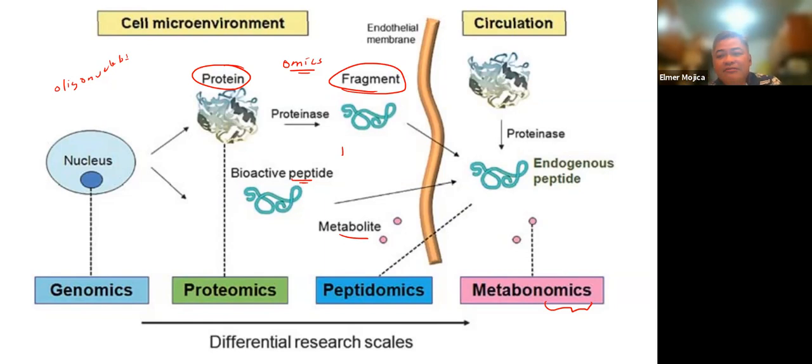Okay? And there are what we call readily available. Meron tayong tinatawag na database. Yung iba nga, free. Okay? Because somebody, a Filipina, who's doing study on Rafflesia, asked me to analyze the mass spec that he got and try to relate it doon sa Rafflesia na merong parasitic plant at Rafflesia on its own. And we were able to determine the difference.